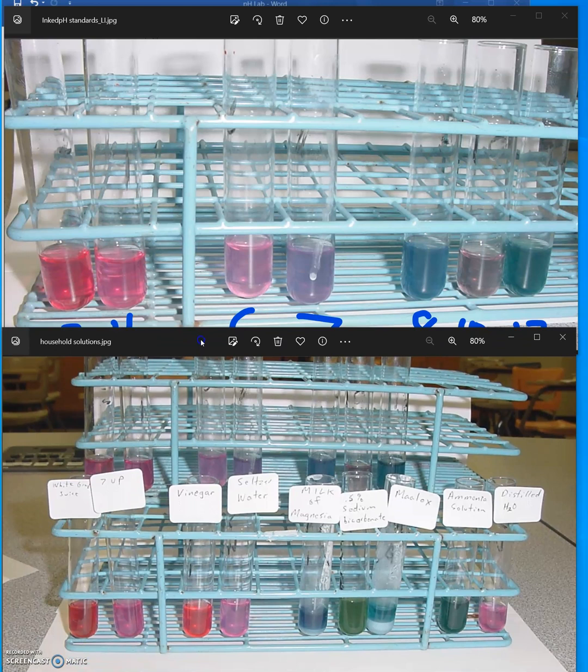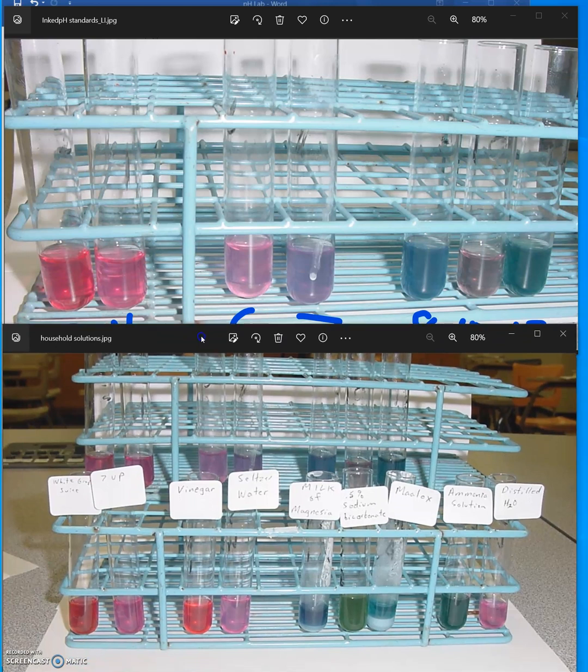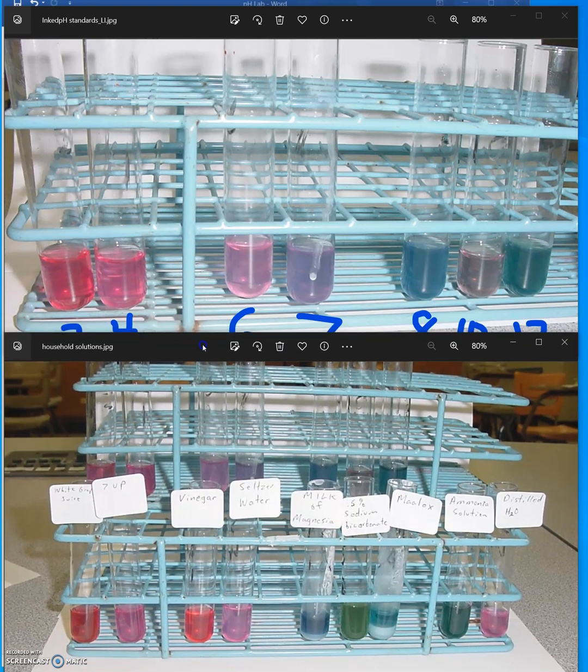And the idea, I'm having trouble fitting these all in, but you get the idea as best I can, that these are labeled as to what substance they are, but we don't know the pH.